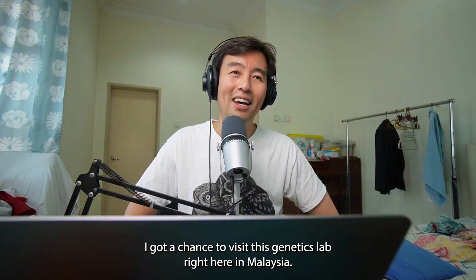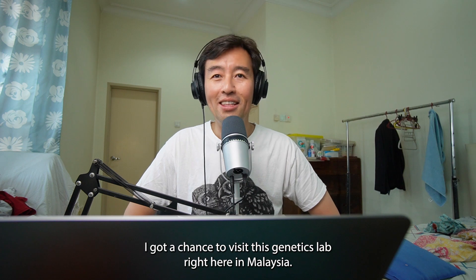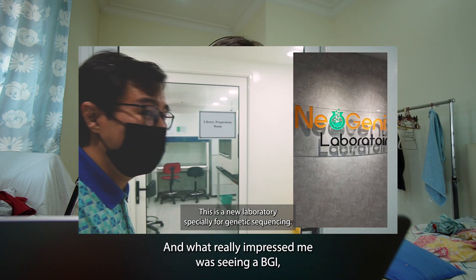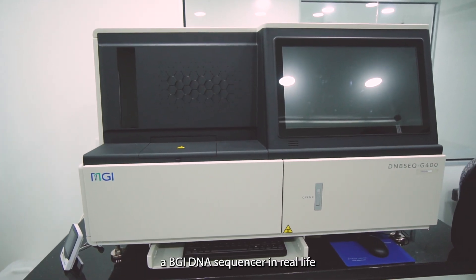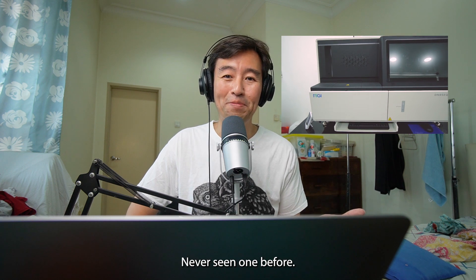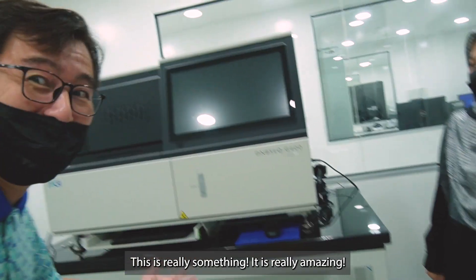Yesterday I got a chance to visit this genetics lab right here in Malaysia, and what really impressed me was seeing a BGI DNA sequencer in real life. I've never seen one before — this is really something, it's really amazing.